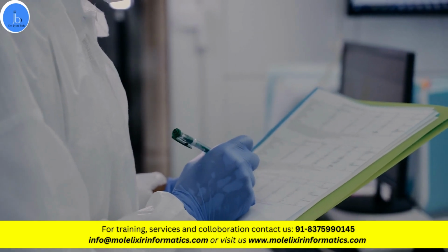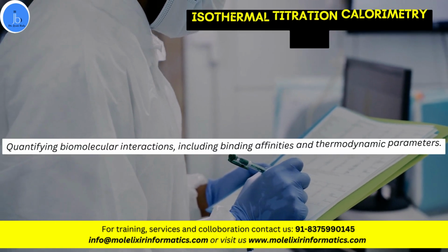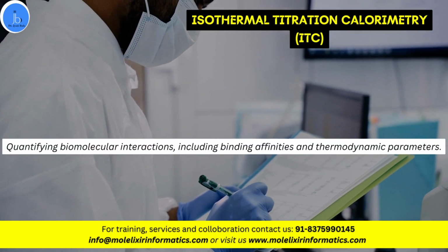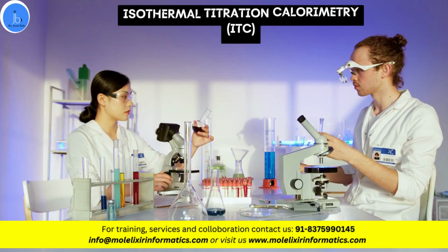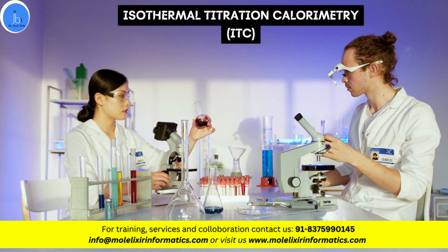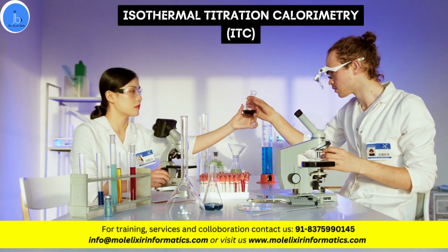The next one is ITC, isothermal titration calorimetry. This quantifies the biomolecular interaction, including the binding affinities and thermodynamic parameters. Here you need to titrate one biomolecule into the other while measuring the heat released or absorbed during the binding processes.